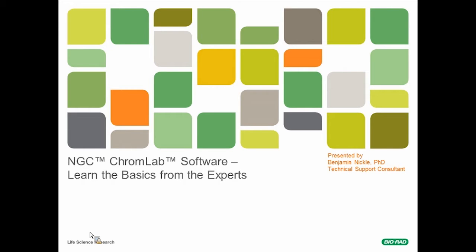For those of you who may be interested in a more detailed discussion on the tools available for data analysis, we'll be releasing a separate webinar in this series that will specifically focus on the software evaluation tools.